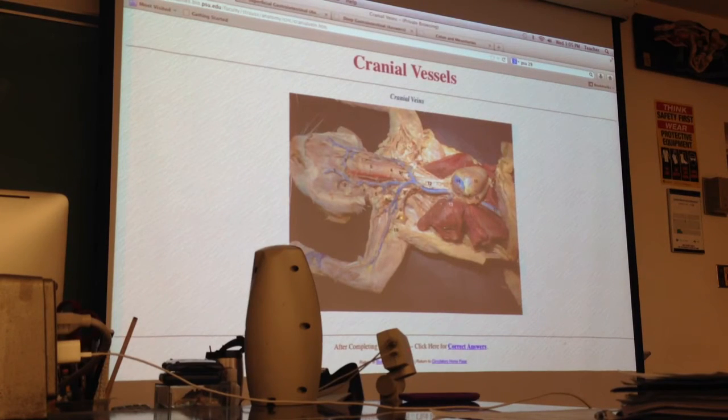So the trachea is going to follow the same naming components. Although with this, it's actually really difficult to pin a cartilage on the trachea because they're very tough, obviously, and they're kind of small. We're still going to word the question appropriately, so if we're asking for the trachea itself, we'll be asking you to identify this space.